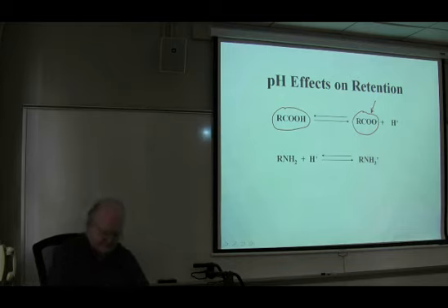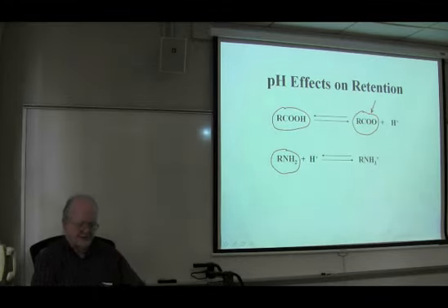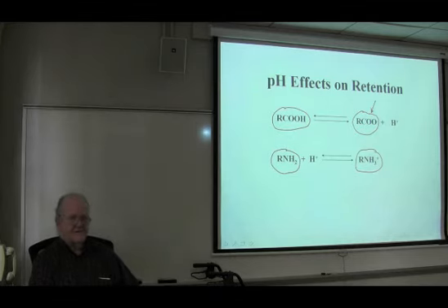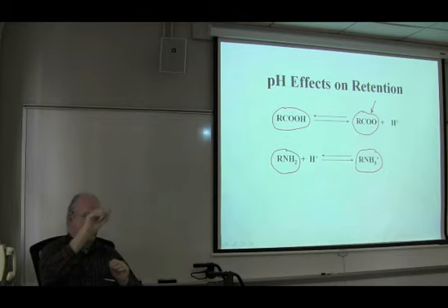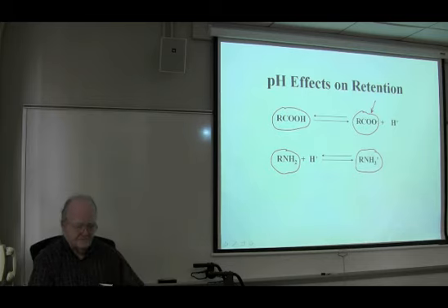Conversely, the non-protonated base, electrically neutral, is going to be less water soluble than the protonated base. So as you change pH, you're going to see retention of monocarboxylic acids and monobasic bases change in the opposite direction, because the neutral compound has a different relationship to the ionized compound.